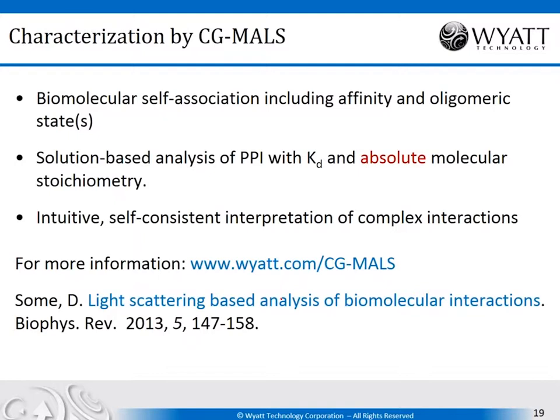And the reason that I say that is because you're getting the molecular weights. So you have the monomer molecular weights, and you know that in order to form a particular complex, the molecular weight of the complex has to add up to the corresponding molecular weights of the number of monomers that go in. And all of this has to be self-consistent. And all of this is provided for you in the software so you can assess the viability of the models and the fit of the results, and is in fact consistent with other information that you have.